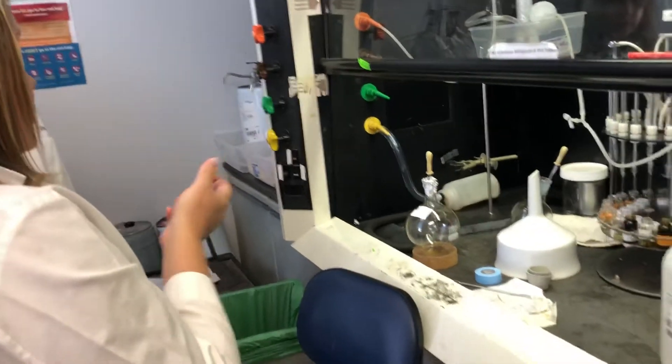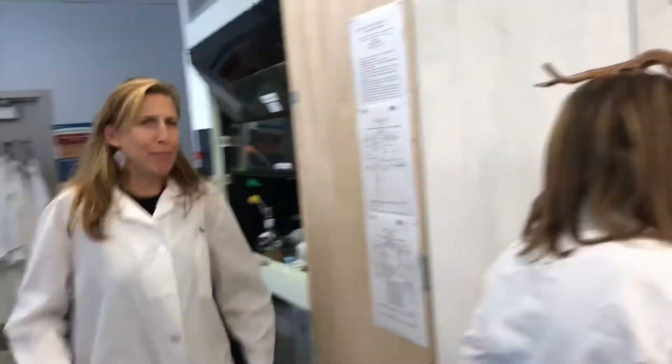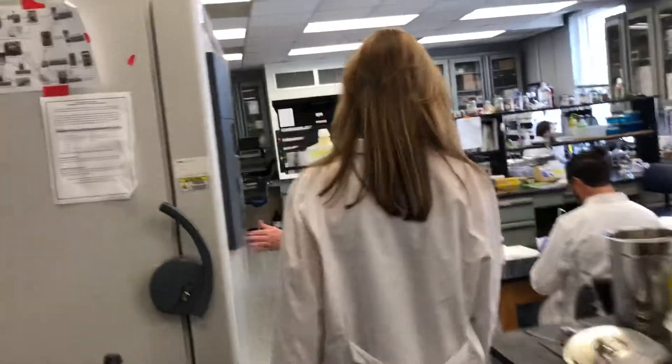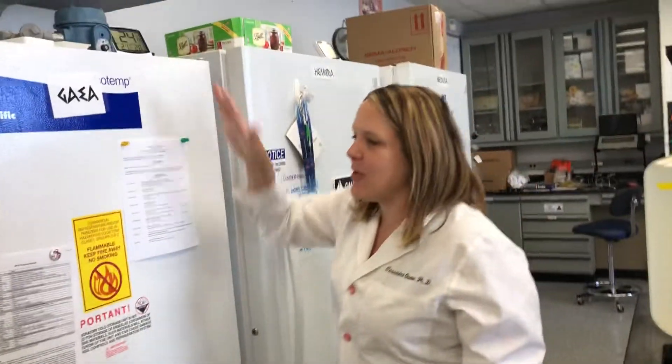We include those in our drug library. We have a lot of freezers and each freezer is named differently — Gaea, the Mother Earth Goddess. So let's see what's in Gaea.